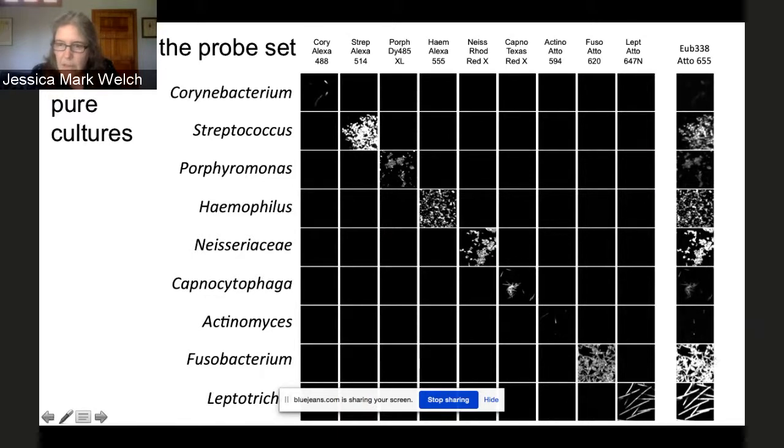These guys down here are bright, these guys here are dim, and that is the kind of difference when you move from your proof of principle with E. coli to a real community where cells have different intensity for a variety of reasons. That starts to introduce technical problems, which was another reason that we kept the labeling scheme very simple.